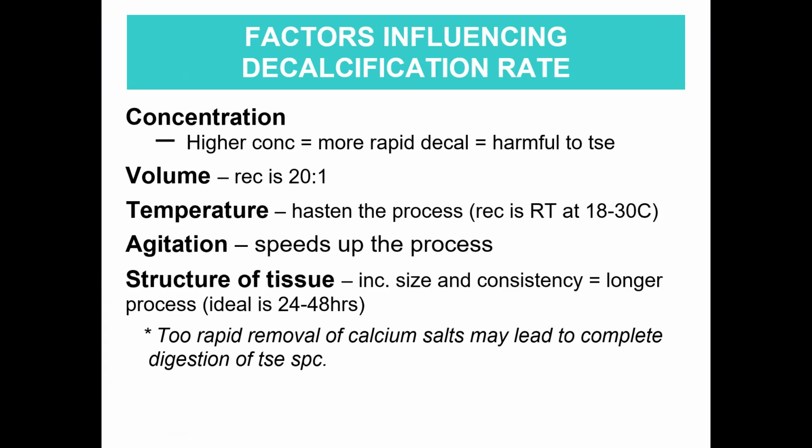So as a review, your decalcification basically is a procedure for the removal of your calcium and your lime salts, which is used for your calcified specimens, your bones and teeth ang most common.